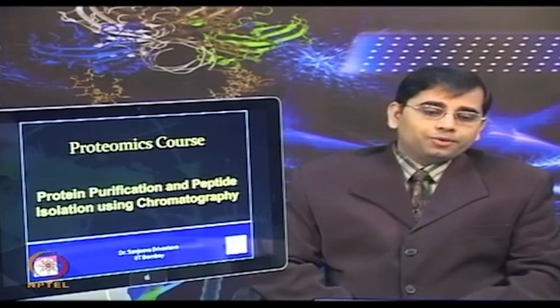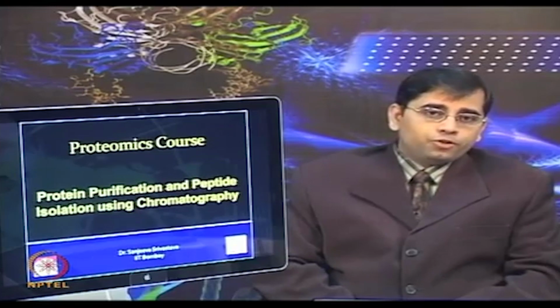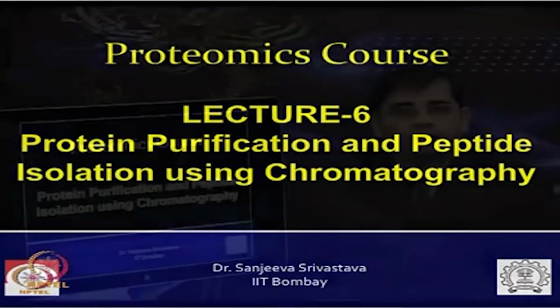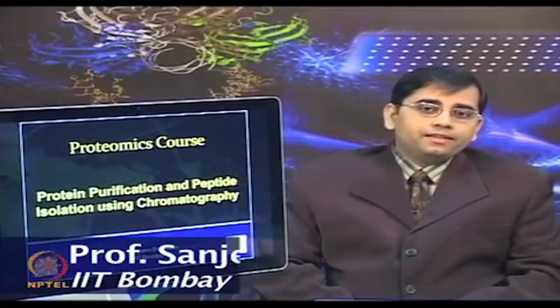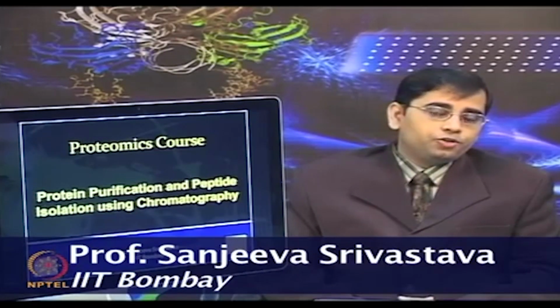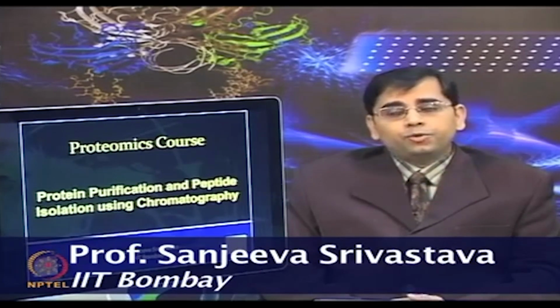Welcome to the Proteomics course. Today we will talk about protein purification and peptide isolation using chromatography methods. The chromatography techniques have always been considered prominent for the separation of enzymes and proteins.